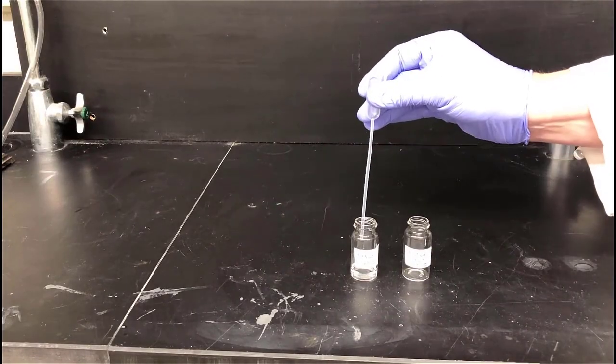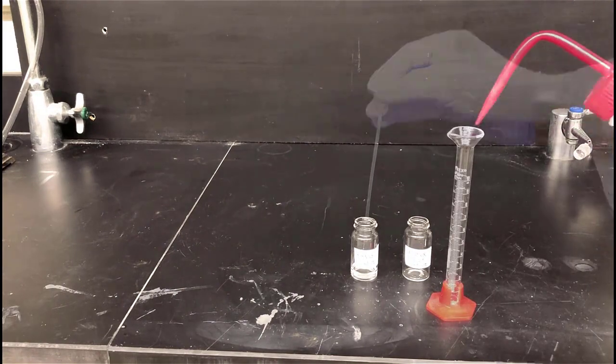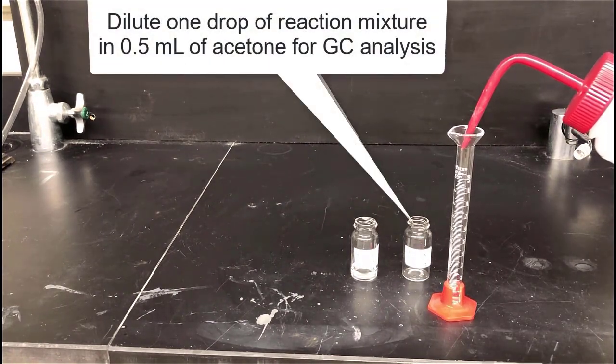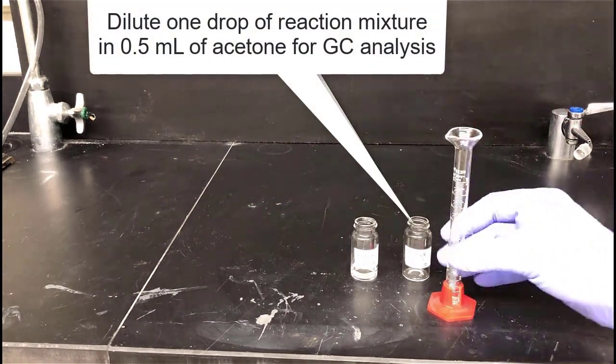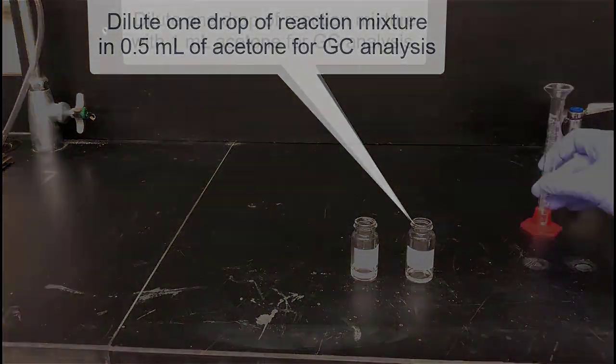We'll need to dilute our sample to analyze it by GC. It's too concentrated to inject directly into the GC instrument. So dilute one drop of your reaction mixture in 0.5 milliliters of acetone.